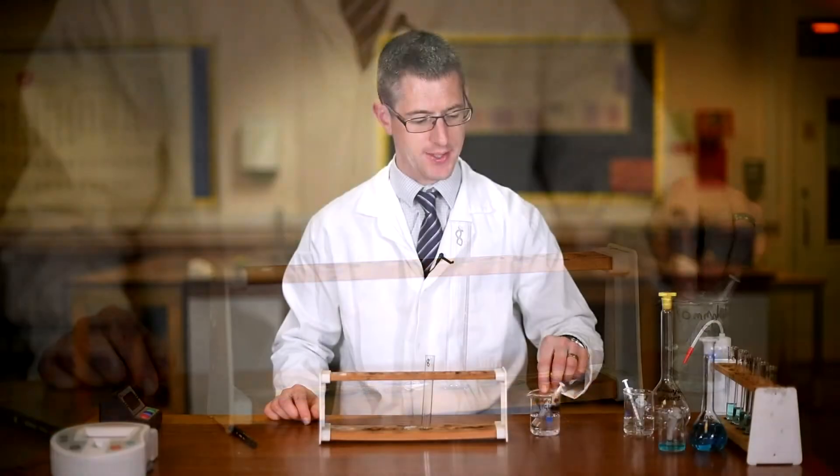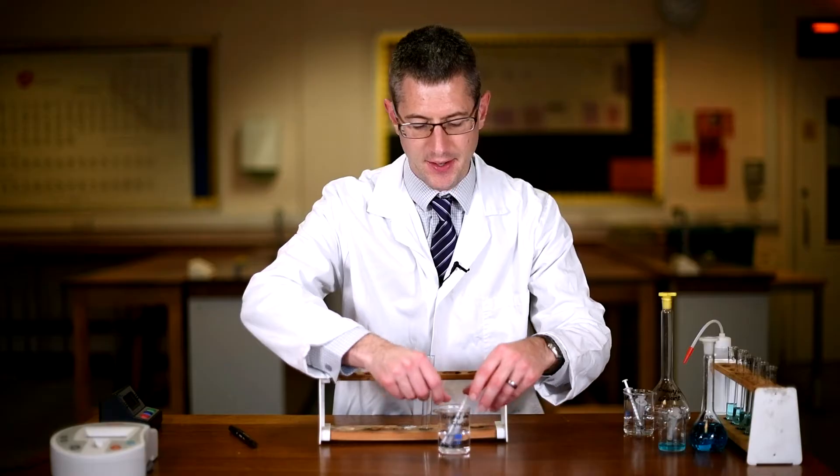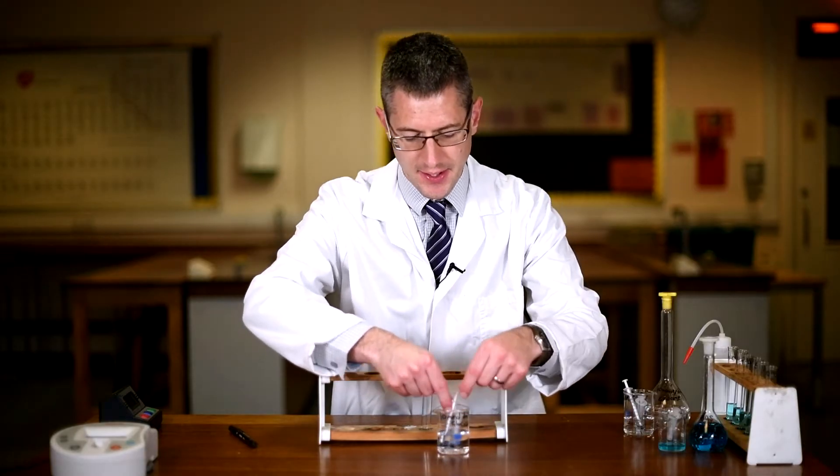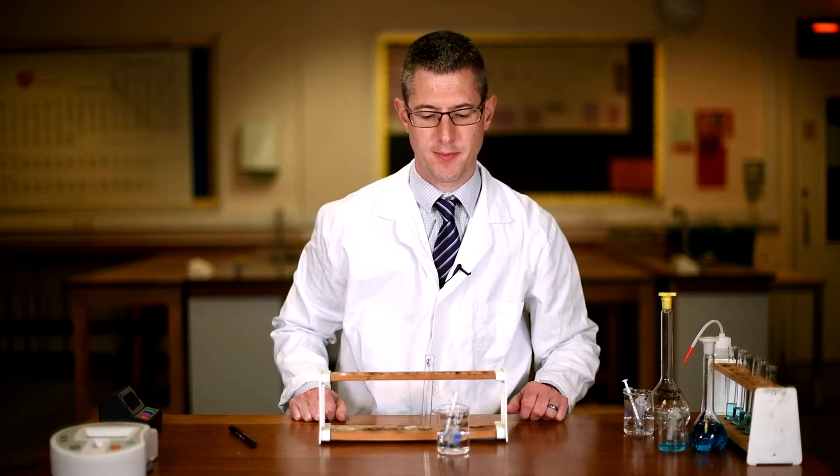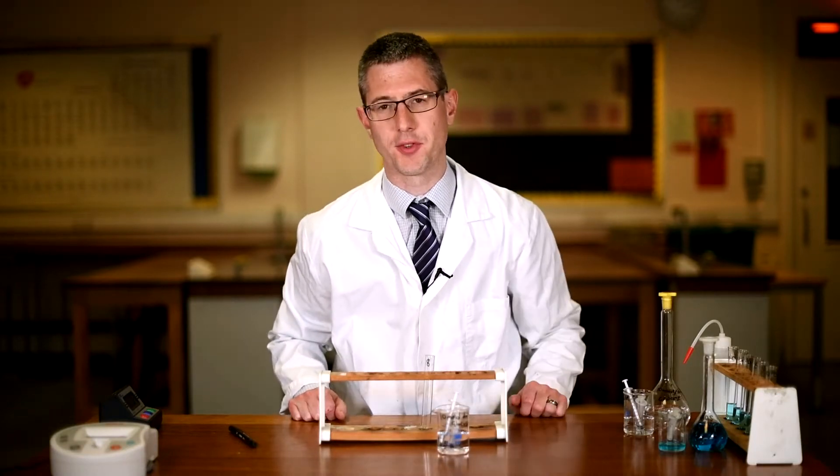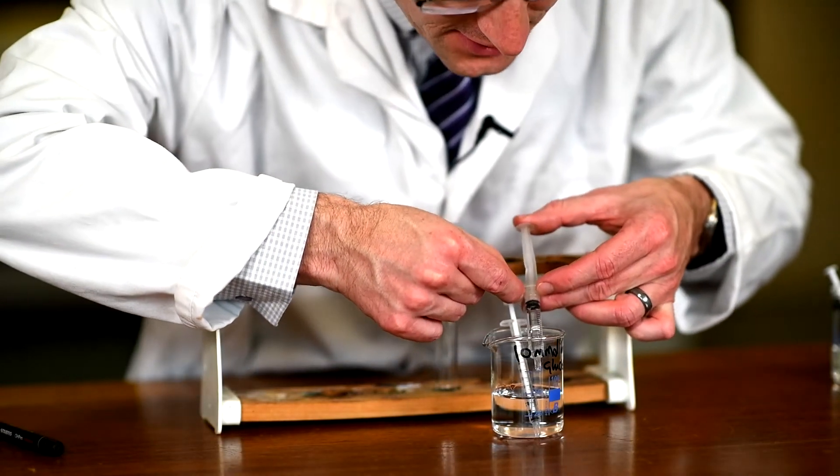We need 1.6 milliliters of glucose. So I'm going to carefully measure this out using a syringe. Now I have two syringes in this beaker. You need to think carefully about which syringe you would choose to measure out this volume. I have a two milliliter syringe and a one milliliter syringe. So using a two milliliter syringe, you get 1.6 milliliters of glucose.